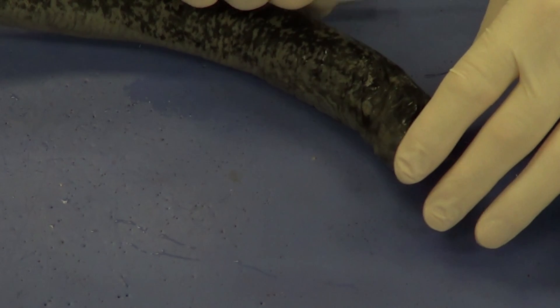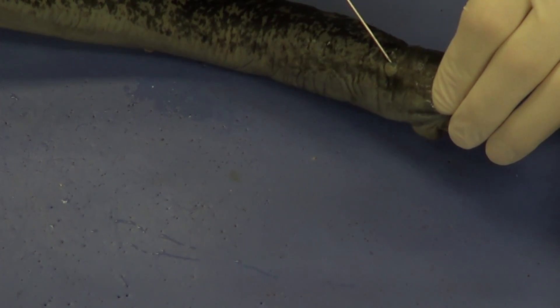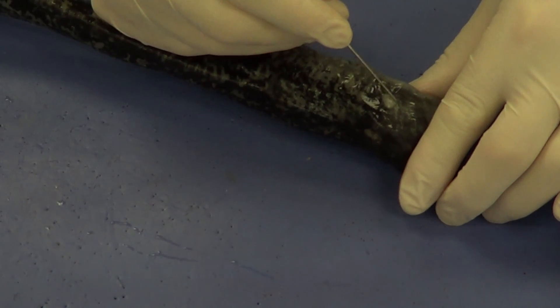If we take a look at the sides here, we can see this opacity right here — this is going to be an eye. The preservative has denatured some of the proteins, and that's why it's cloudy. Here's another eye over here.